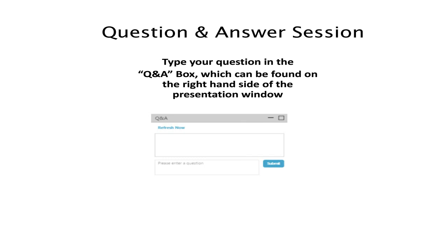Our next question is, can we do only one active air sample for an 8-hour sterile fill using a BioCapt, as robotic fill may not have been an option of replacing the BioCapt? Well, this is a very good question.